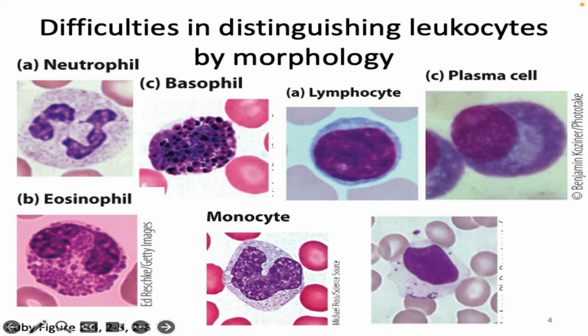The other thing that we could do is have some way to get more information about the cell than we're getting here. If we could somehow get more information, that would either make you more certain, or it might help you determine, is that lymphocyte a B cell or a T cell? So if we had some way to get more info, that would be cool. And if we had some way to get more cells.